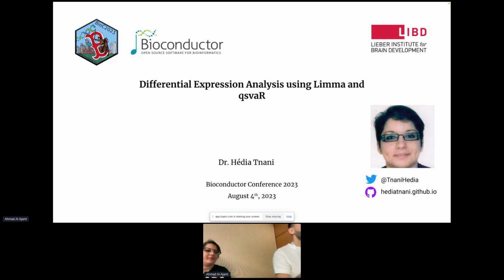Thank you, Ahmed, for the nice introduction. Can you hear me well? So I will be presenting the differential expression analysis using limma and qsvaR. So this will be a package demo about qsvaR.